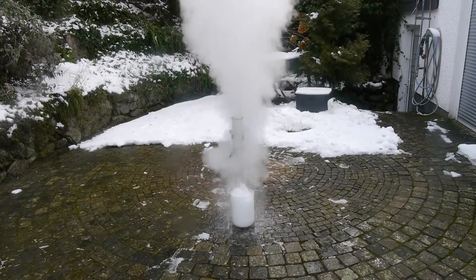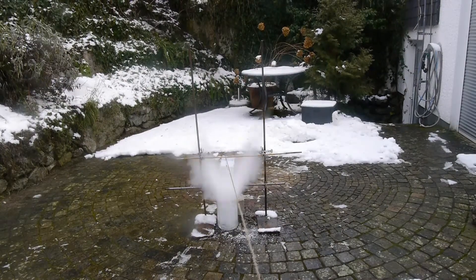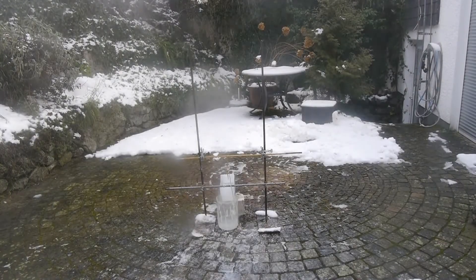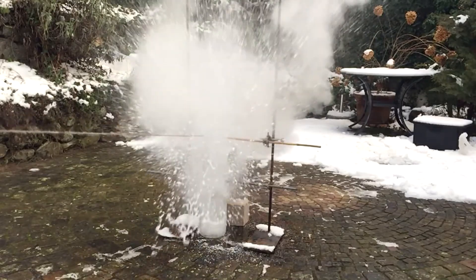Let's try again with a solution of sodium hydroxide. That was already on a different level. Jesus.